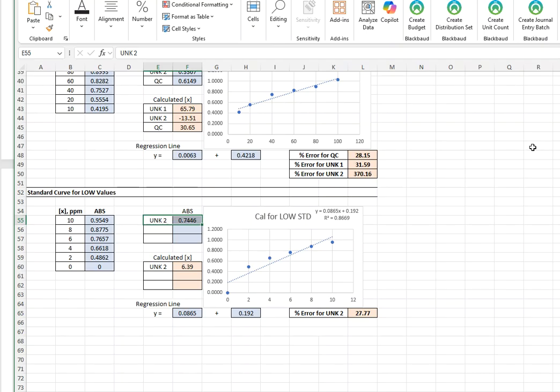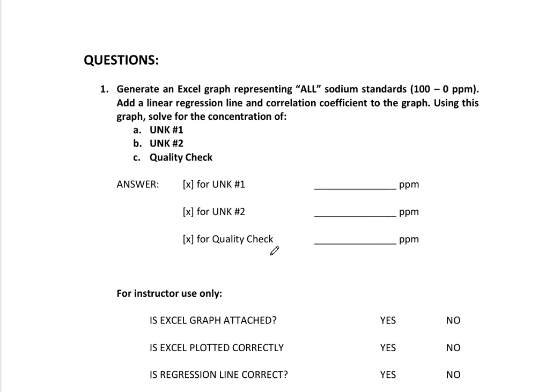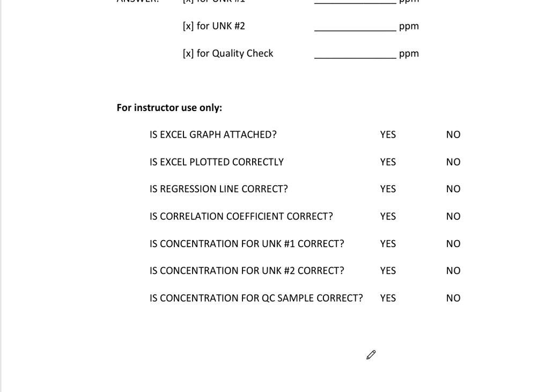All right. Just as before, we solve for errors, and you need to know actual concentrations before you calculate errors. And we'll give you those after the lab is over. All right. So that's what this lab experiment is all about. It's just atomic emission, not absorbance. It's plotting them in different ways to see how these concentrations are affecting the lines, because some of them will not be linear, as you've seen from one of those examples. And how can we manage these standards to get something a little bit more linear, but also a working range with sodium in order for us to get really legit good numbers as far as data goes.